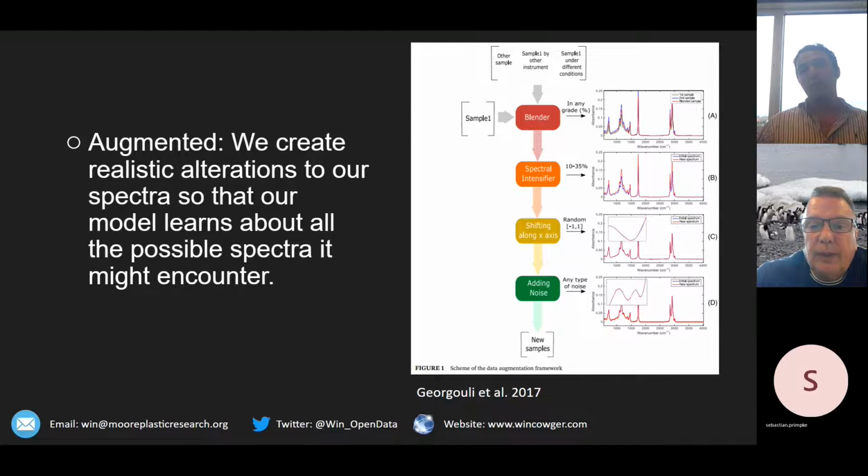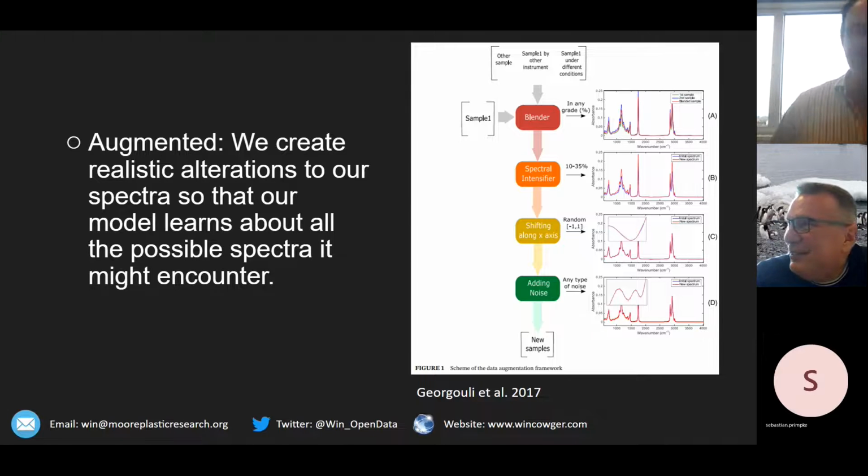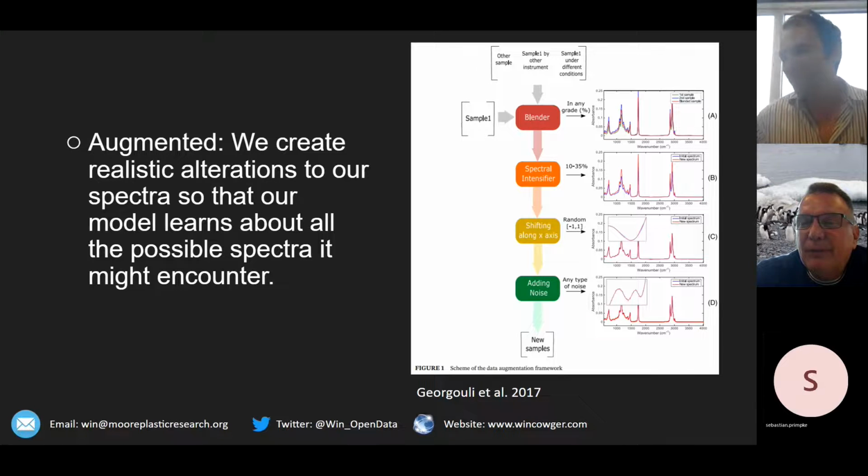It could be really great to just throw your sample into a pyrolyzer and get the mass of all the plastics in it. That's the dream. That's not really happening. No, it's not. I know. Particle sizes, and we. Right. The good thing is those can easily be combined.